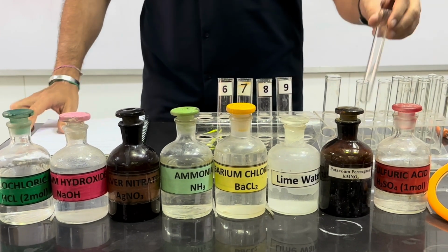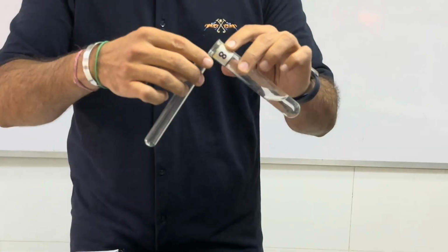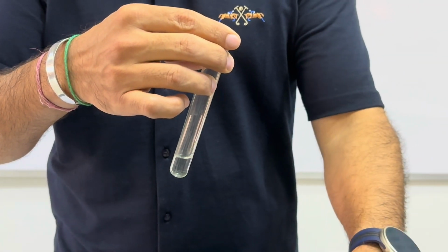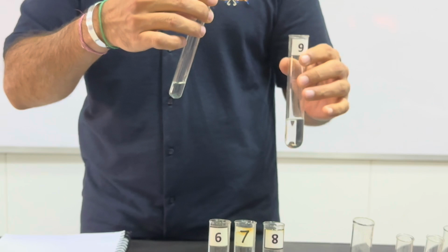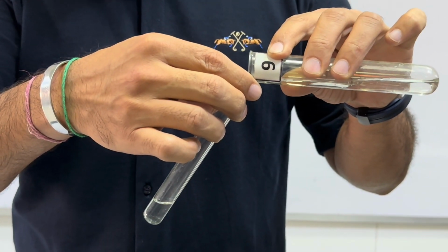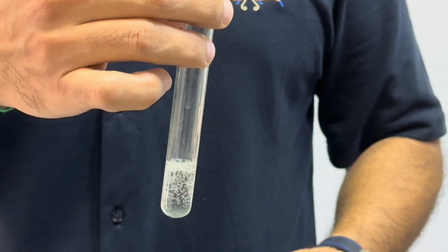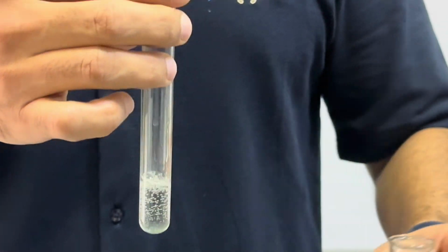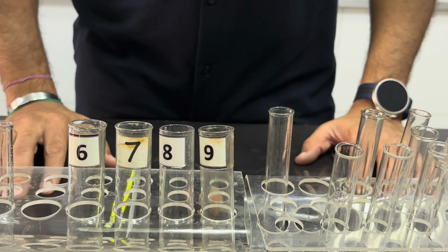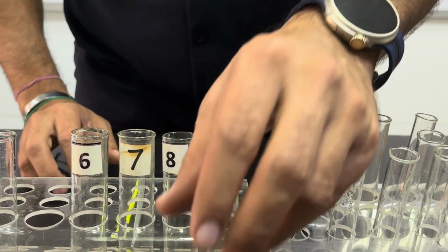Now we will take a test tube in which we will take 1 centimeter of FB8, and in this we will add 1 centimeter of FB9 until the reaction is complete. Once we add FB9, oh, fizzing is happening. It means it must be carbon dioxide. So let's test this gas. In order to check whether the fizzing was carbon dioxide, we will pass the liberated gas through lime water.